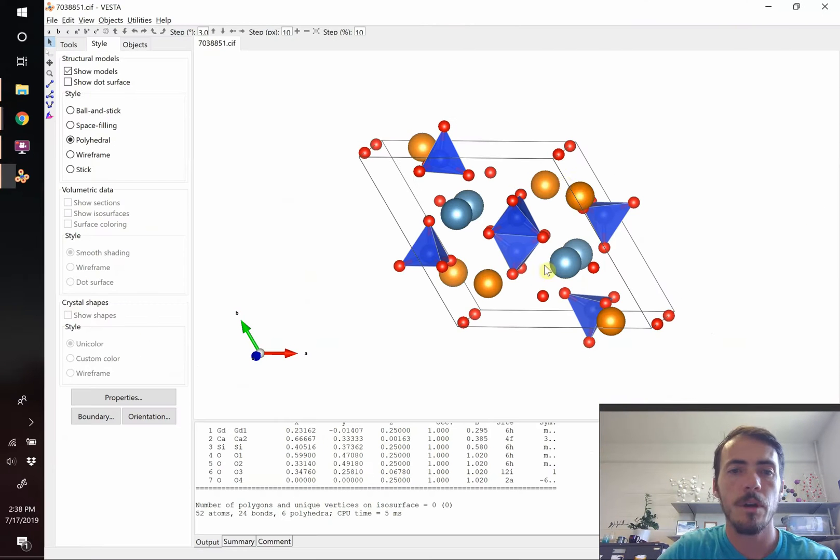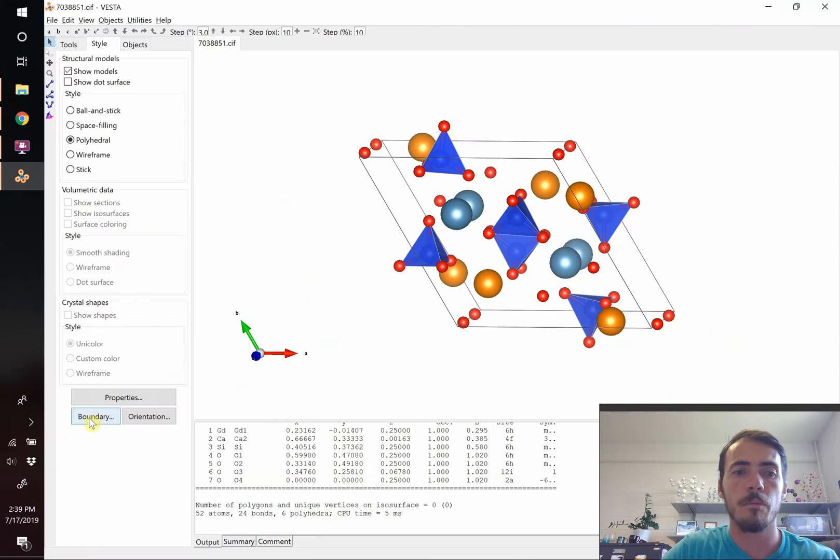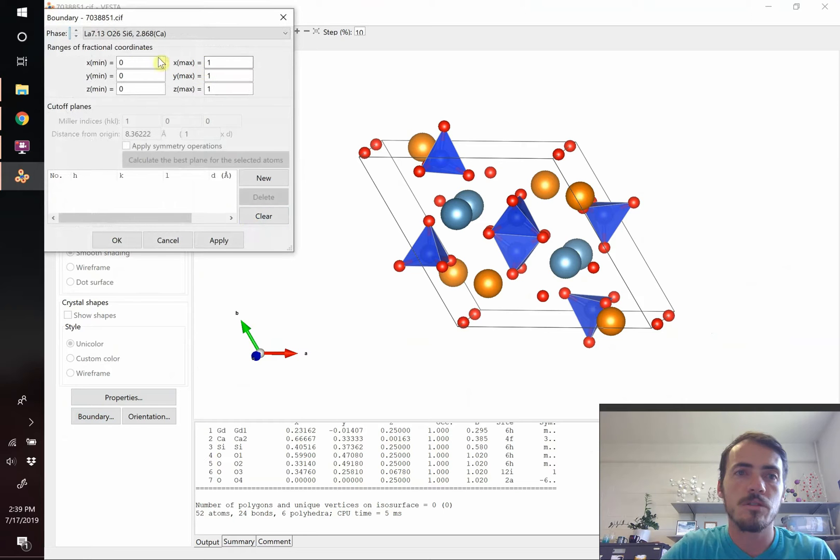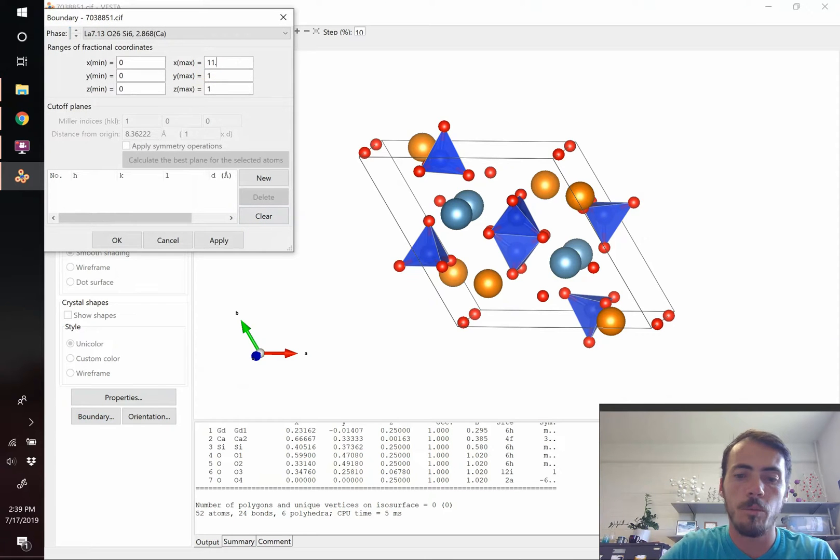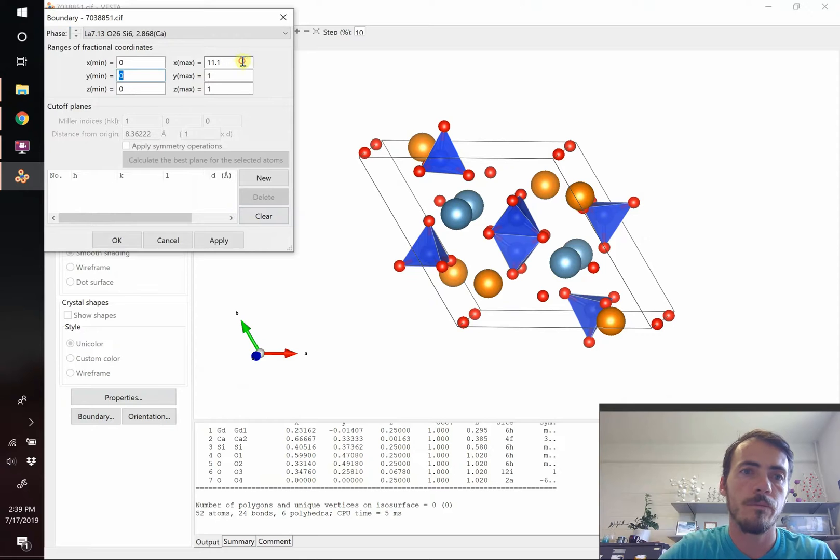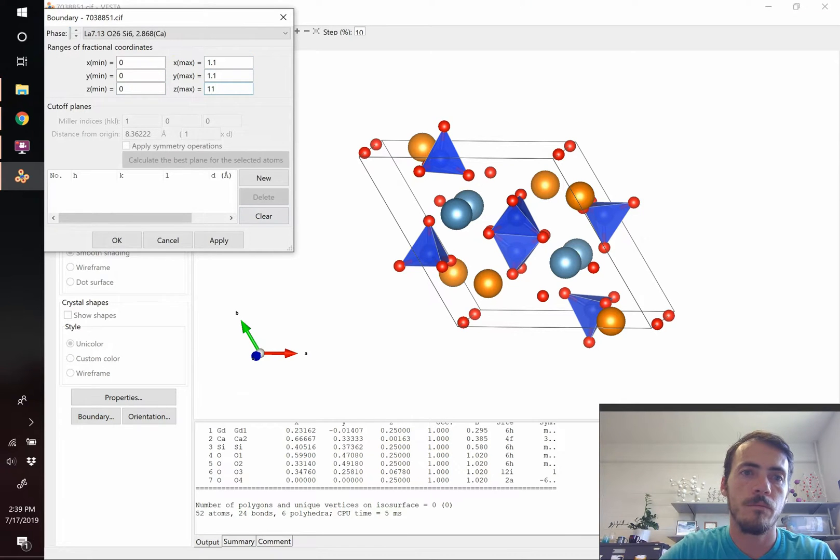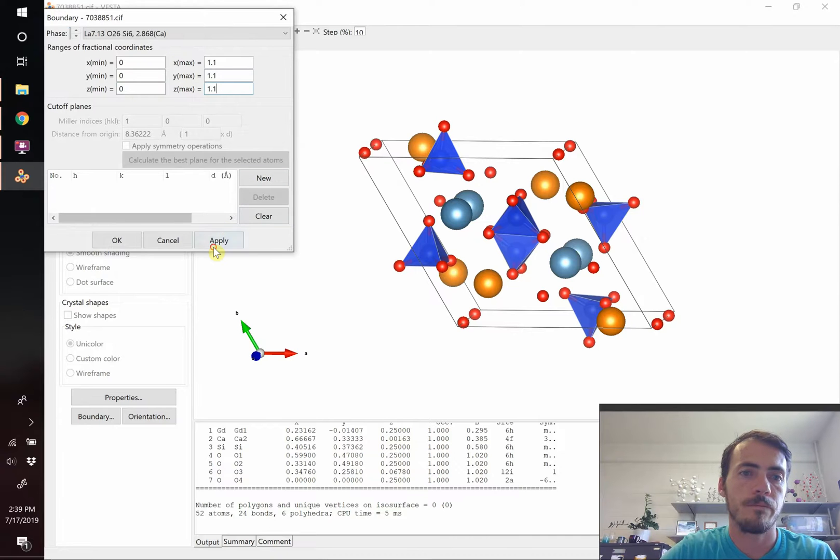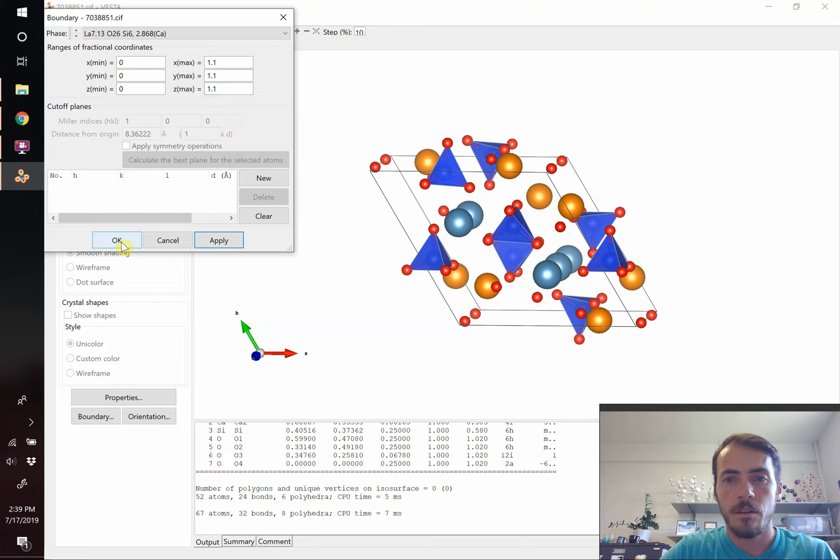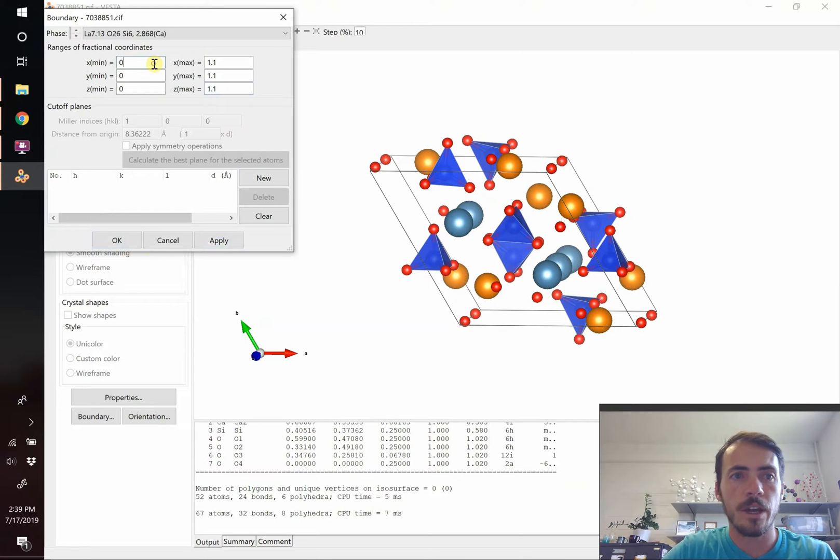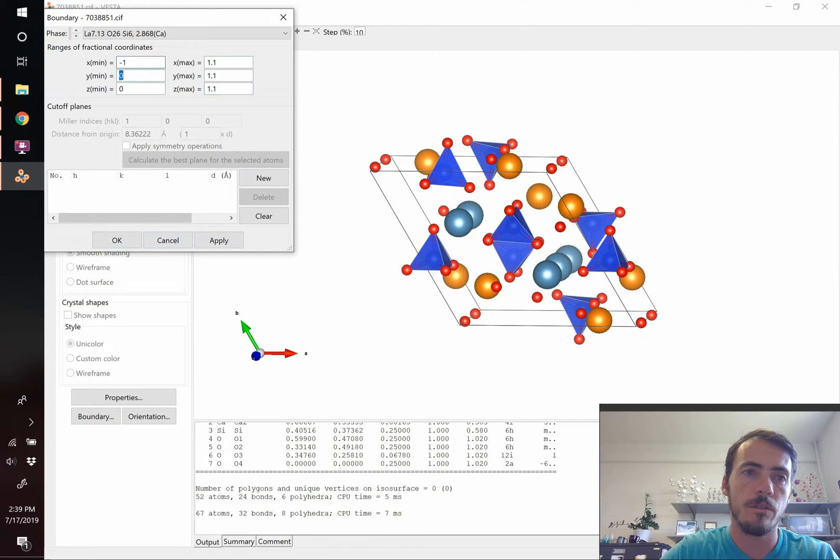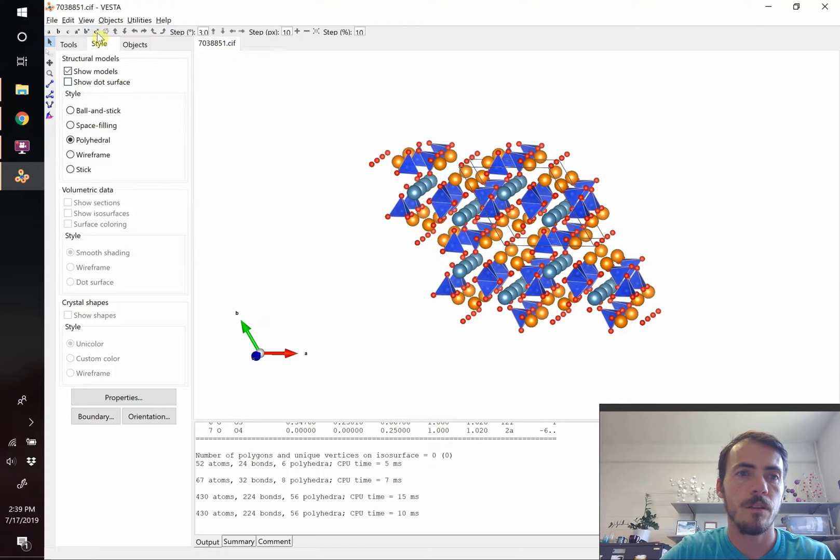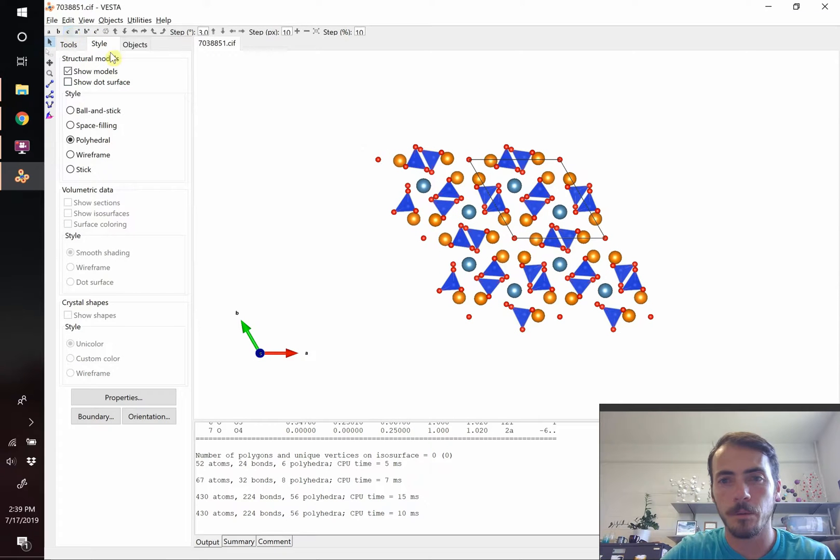So what we're going to do is we're going to extend our search in our boundaries, instead of going from 0 to 1 in all these directions, let's go from 0 to 1.1. Oops. Let's try that for now. Better, it's still missing some, let's go negative. In fact, let's go from negative 1 to 1.1 in all of these. Let's look right down the c-axis to clean it up a little bit, and it's getting better.